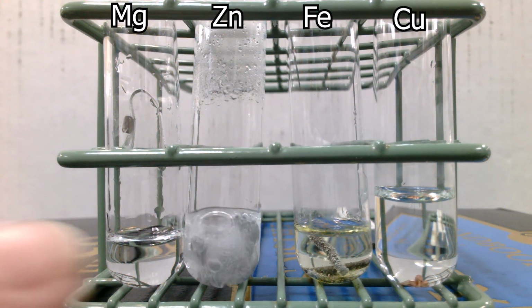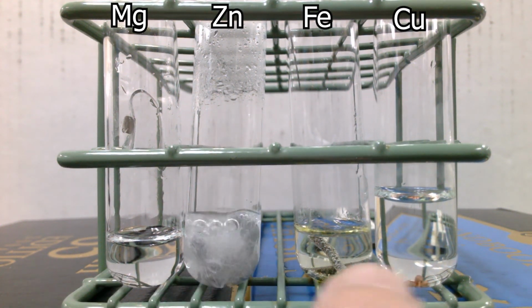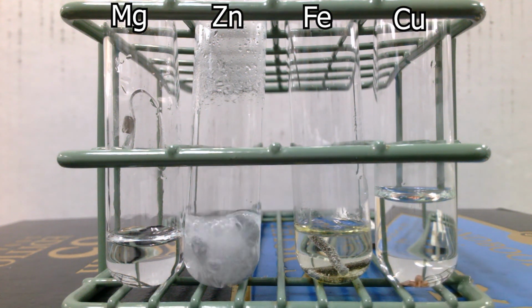All right, so make sure you record again, this first one here was magnesium, then we got our zinc, the iron, and then we had the copper. So record your observations in your report sheet for part B, the reaction of metals with acid.